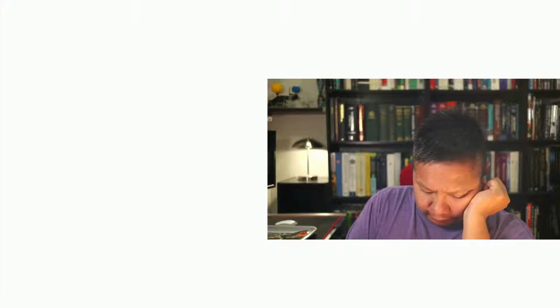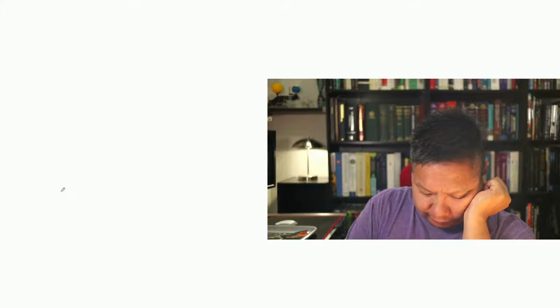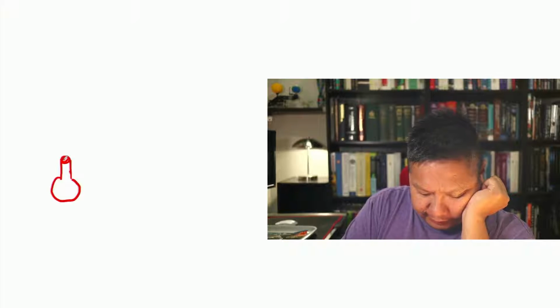So today you'll be doing a fractional distillation, and part of that is, let me just draw what it looks like real quick. You have a round bottom flask, okay? I've never been good at drawing round bottom flasks, so I'm going to try that one more time. There we go. That's a little bit better, right? And then the round bottom flask is connected to this thing called a fractionating column, right?